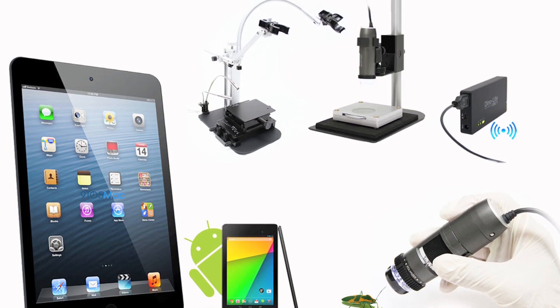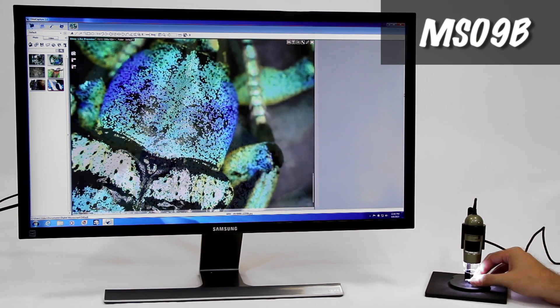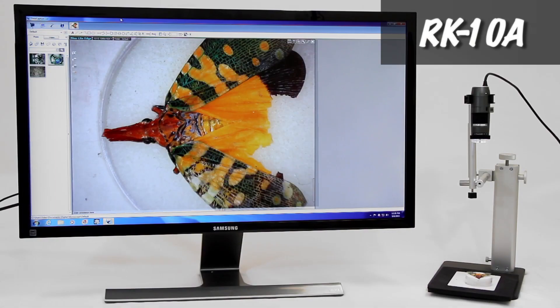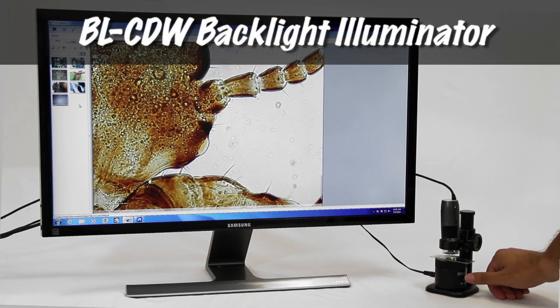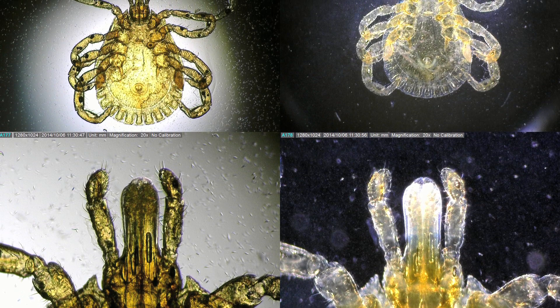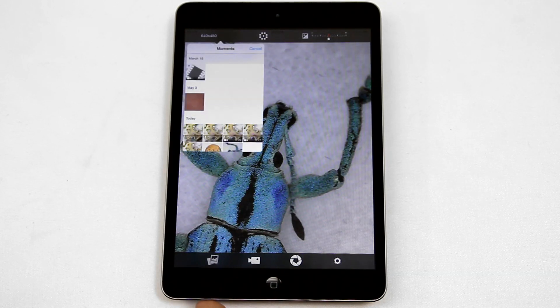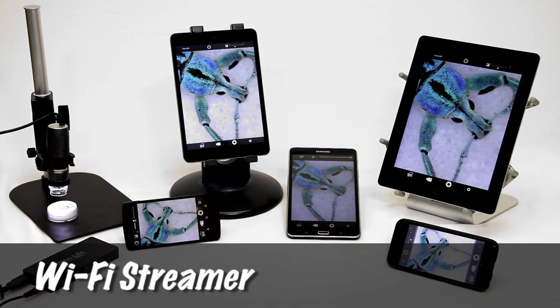Here are some compatible and recommended accessories. The BLCDW is a backlight stage with bright-field and dark-field illumination modes. Compatible Dynolite models can also stream wirelessly to Wi-Fi enabled Android and iOS devices via the WF-10 Wi-Fi streamer.